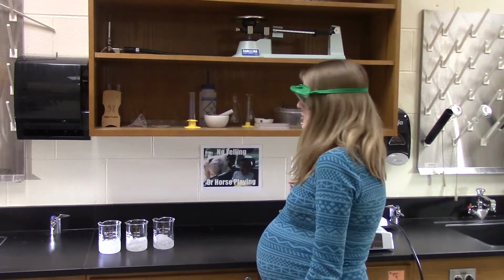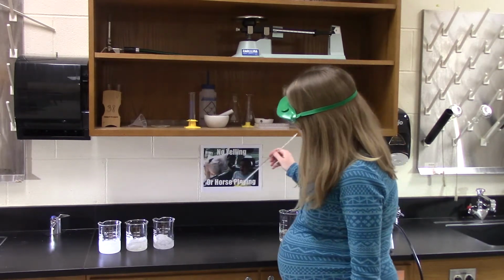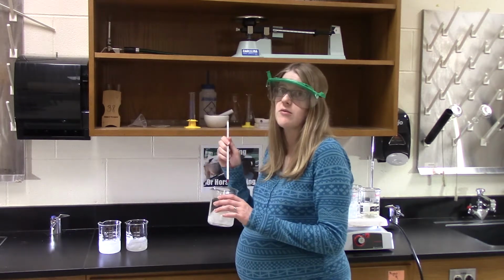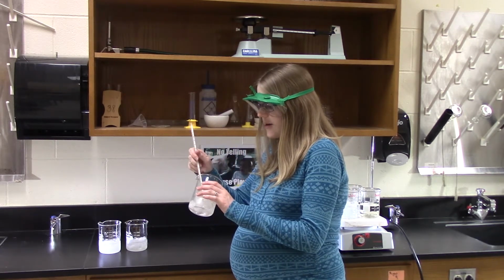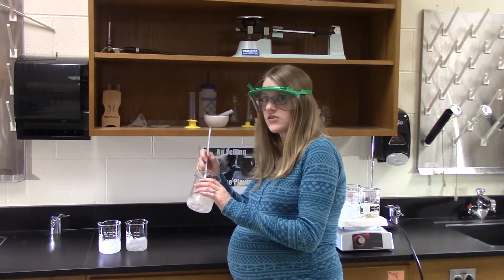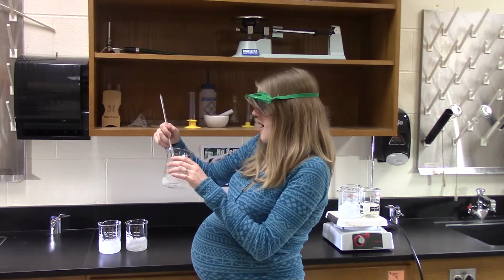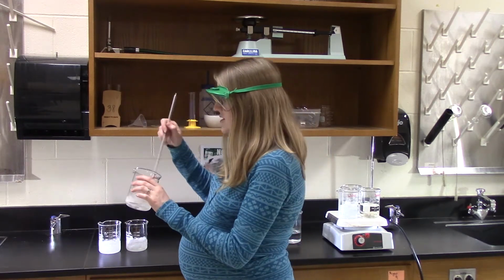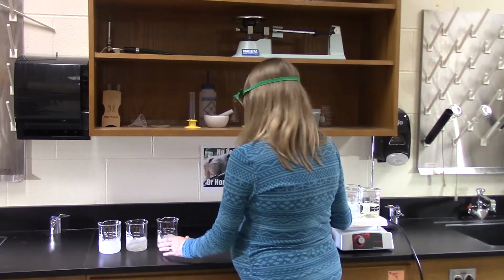So now let's get the temperatures. We are looking at, for the water, just by itself, I would guess this to be actually a little higher than 0 because I'm actually measuring the liquid here, not the ice. So I'm anticipating this being a little bit higher than 0. Yeah, and we're looking at 3 degrees. That's pretty typical. That's what's to be expected. So 3 degrees for the ice by itself, no solute.